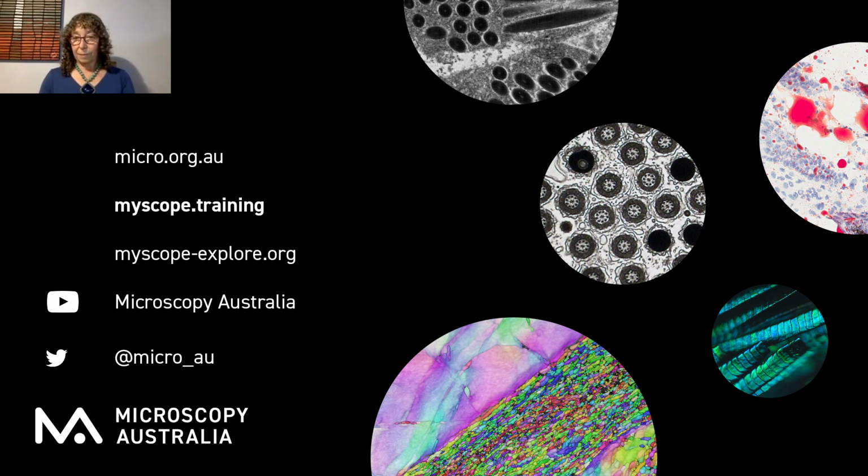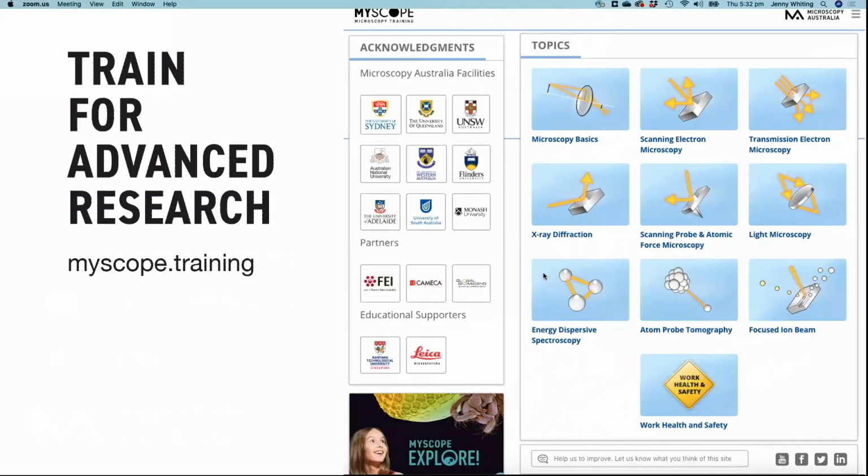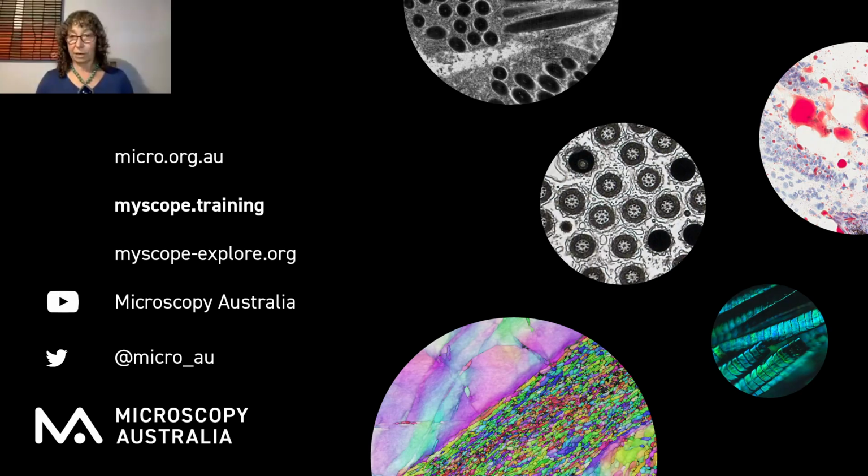Another question. Is there EDX-WDS in the electron microscopes? Yes, there's an EDS module in the list. Let me just come back here and share my screen again. Right, so here is energy dispersive spectroscopy. So yes, EDS is covered in there. Let me stop sharing again. Right, what else have we got in here?